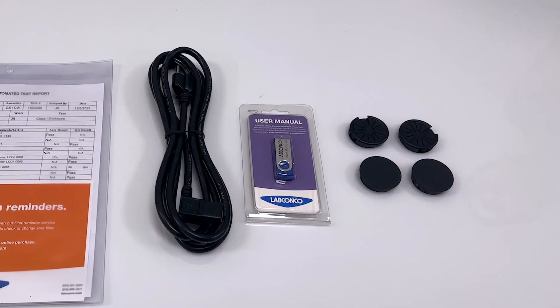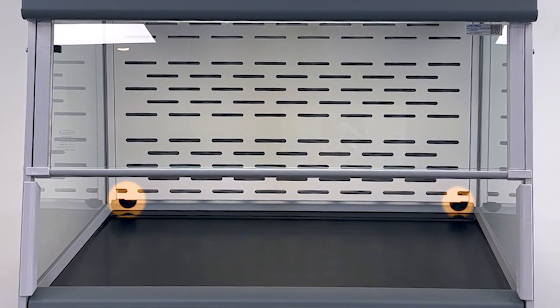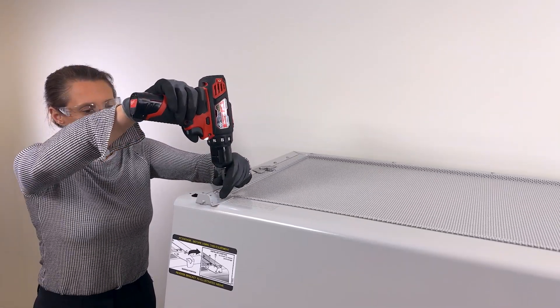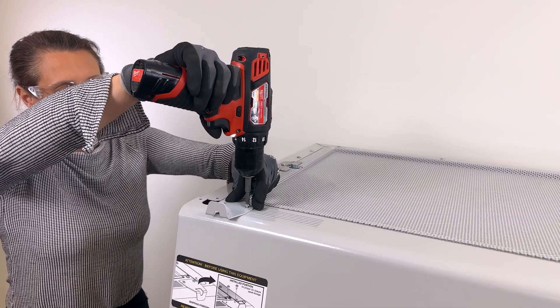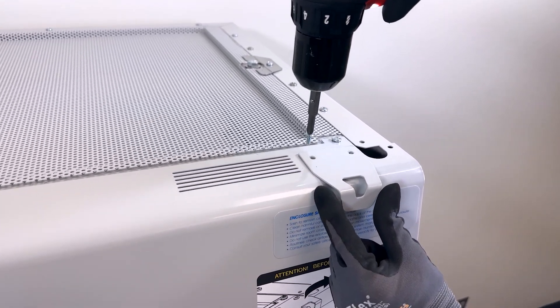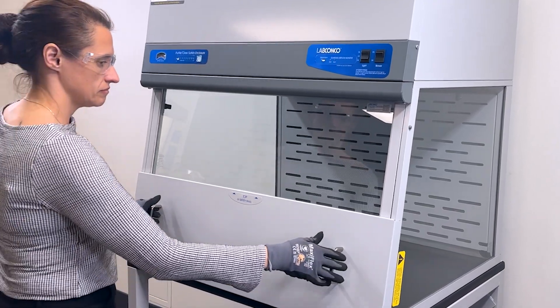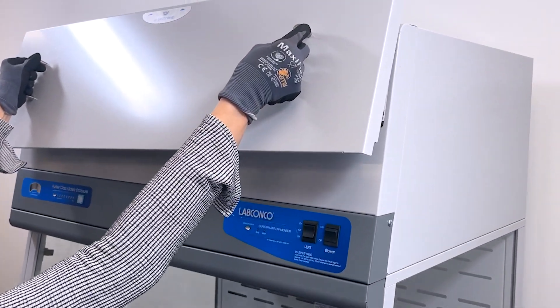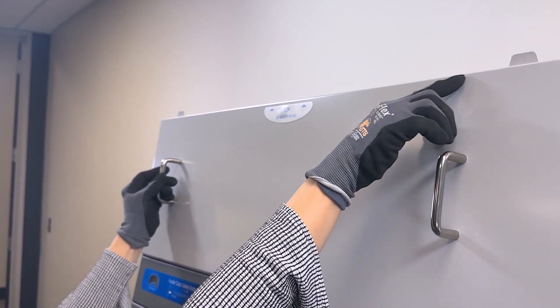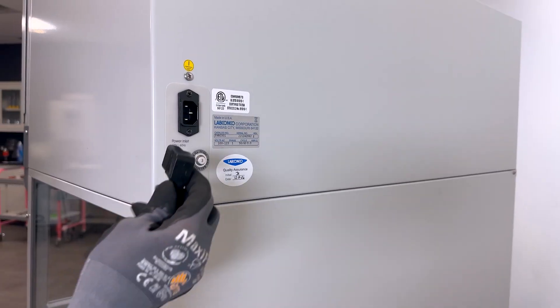Continue with the installation of the left and right side cord and cable pass-through plugs. Solid plugs are provided if no cables will be used; pass-through plugs are provided if cables will be passed into the enclosure. Insert each plug into the back wall from inside the enclosure. If your model includes a UV light, proceed with setup of the UV protective panel hooks — instructions for installation are shown on the front panel of the enclosure. The hooks are included with the enclosure but must be flipped over and reinstalled. After installation, test that the front panel can securely rest on the enclosure between uses with the storage hooks protruding through the top of the protective panel. Remove the UV installation and airfoil stickers.